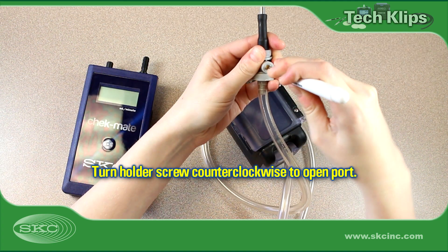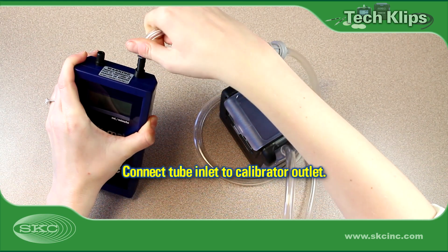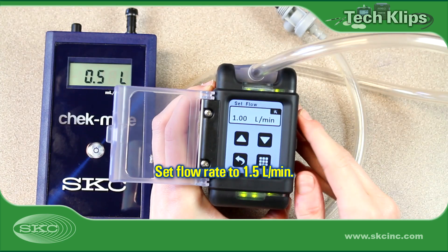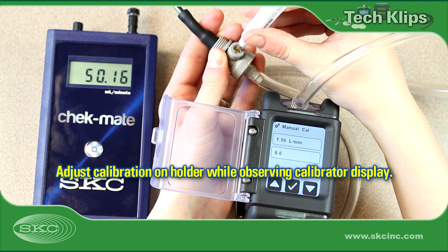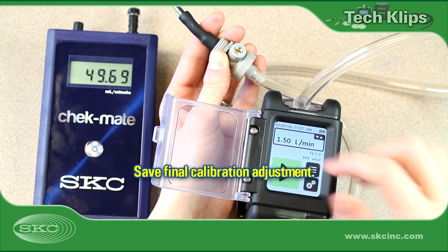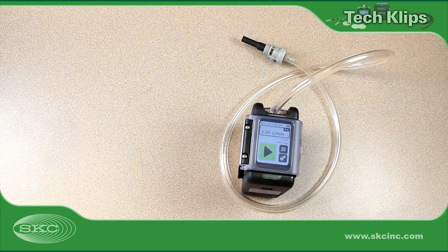Use a small flathead screwdriver to turn the screw on the holder counterclockwise to open the port. Attach tubing from the sorbent tube inlet to the calibrator outlet or suction port. After charging the pump battery, it is best practice to run the pump for five minutes to allow the flow to stabilize before calibrating the flow rate. Set the pump flow rate to 1.5 liters a minute. Enter pump calibration mode and use a flathead screwdriver to turn the screw on the holder counterclockwise until the reading displayed on the calibrator remains within five percent of the method-specified flow rate. Save the final calibration adjustment. The exact steps will vary with model. Remove the calibration train and keep the low-flow tube holder attached to the pump for use in collecting the sample in the field.